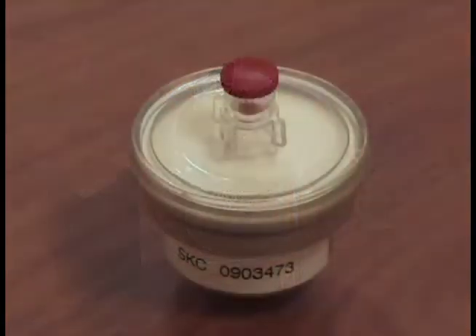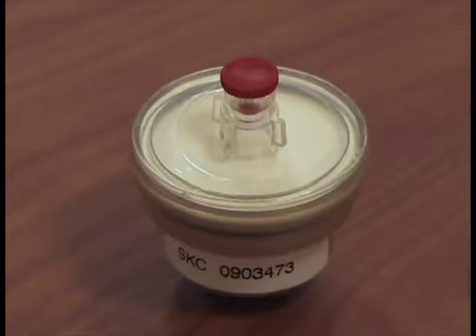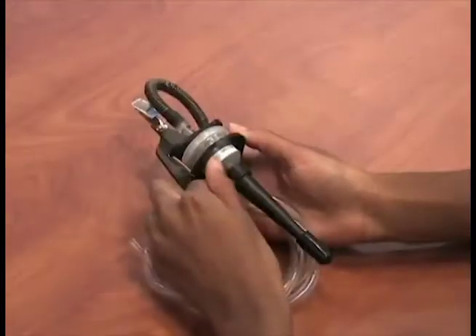The SKC DPM cassette is designed for sampling in atmospheres where it is necessary to differentiate diesel particulate matter, or DPM, from other respirable dust based on particle size. This differentiation is performed using a specially designed precision jeweled impactor built into the cassette.